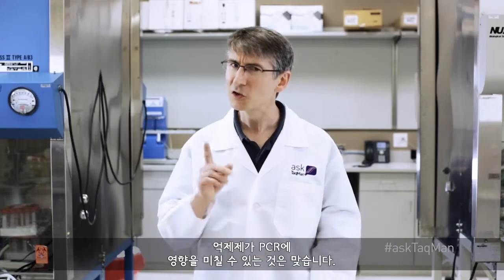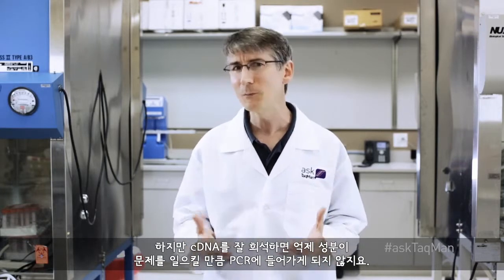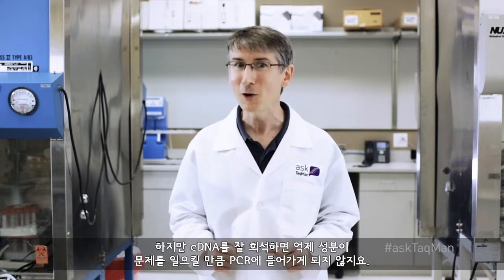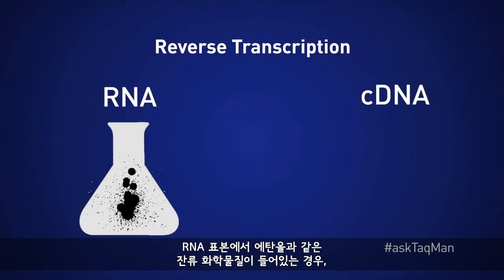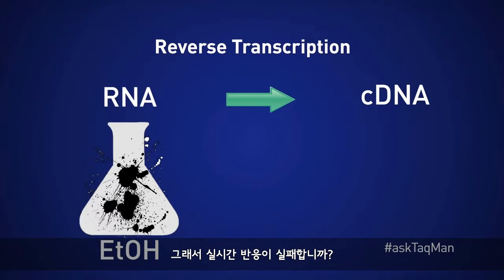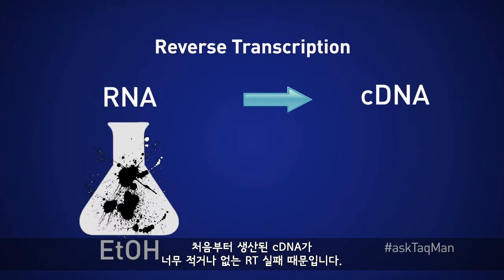Yes and no. It's true that inhibitors can have an impact on PCR, but cDNA tends to be fairly dilute, and so inhibiting compounds are rarely introduced into PCR at sufficient quantities to cause problems. That said, if the original RNA sample is really dirty or contains lots of residual chemicals from the RNA prep, such as ethanol, it's likely that the reverse transcription step itself won't be successful. So failed real-time reactions are often not caused by cDNA being dirty, but rather by an unsuccessful RT that produced little or no cDNA in the first place.